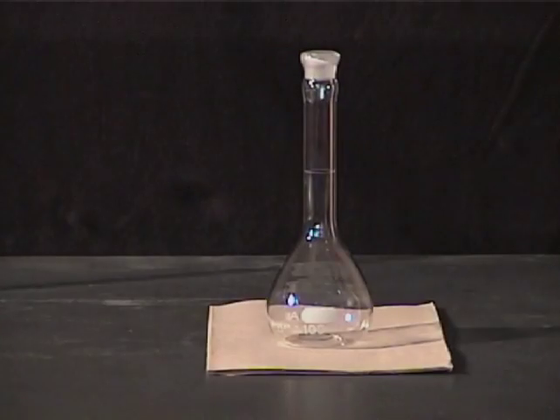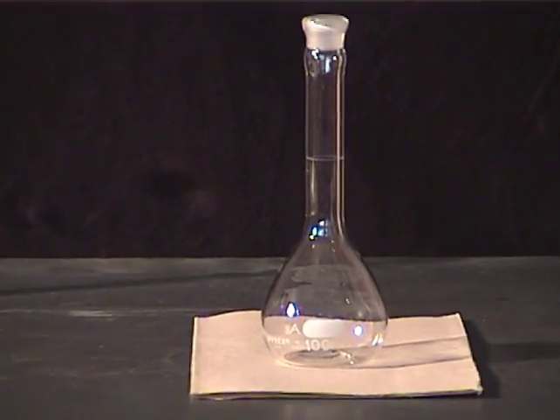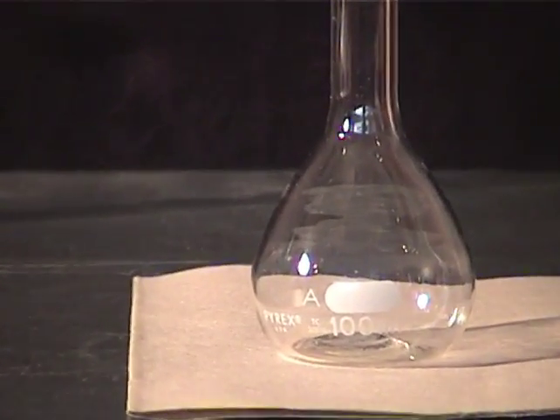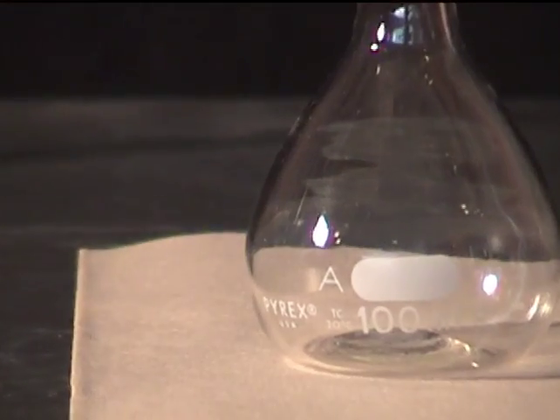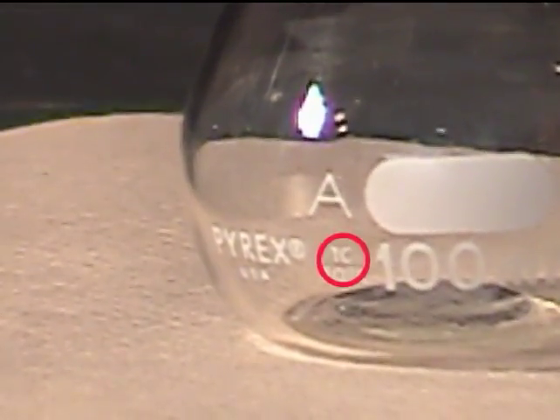A volumetric flask, on the other hand, is calibrated to contain a specific volume of liquid at a given temperature. If you inspect the label printed on a volumetric flask, you will see the designation TC, meaning to contain.